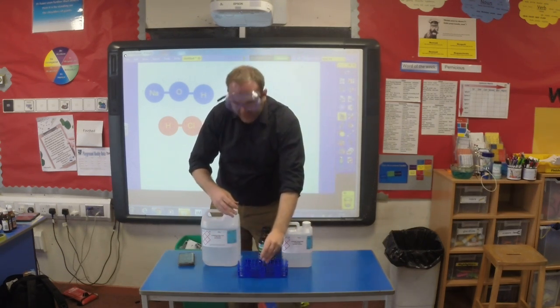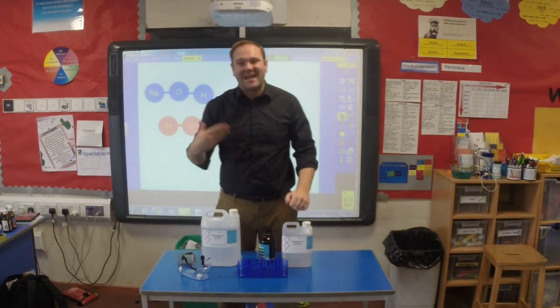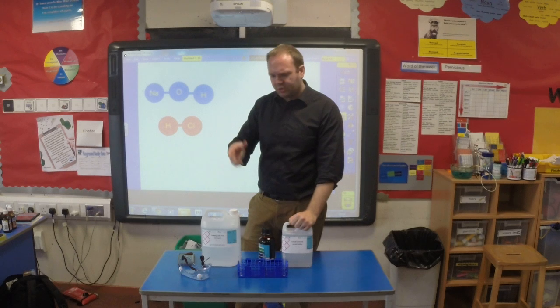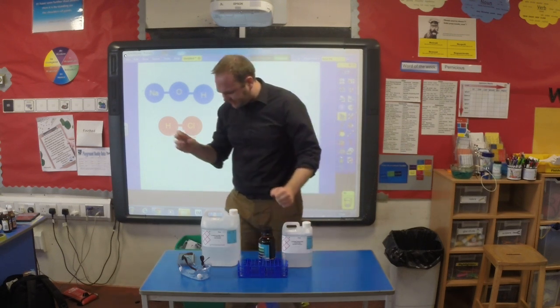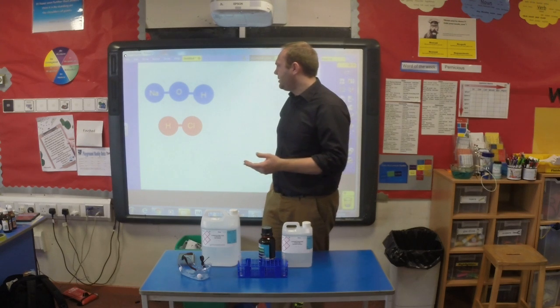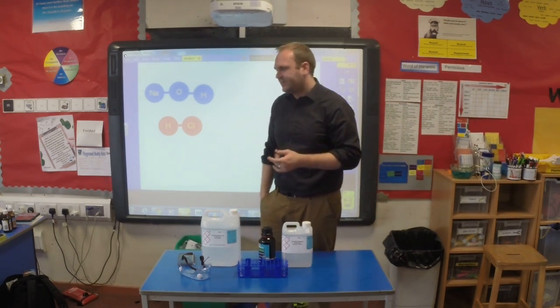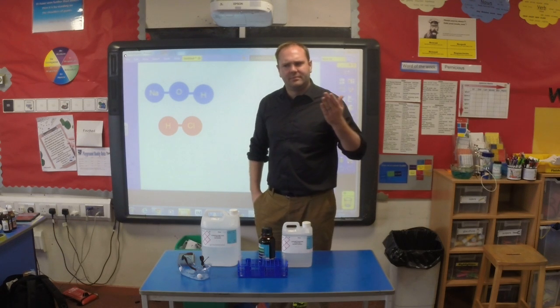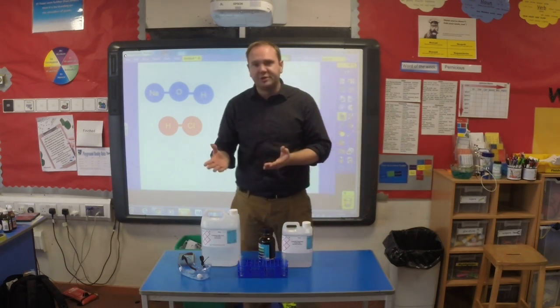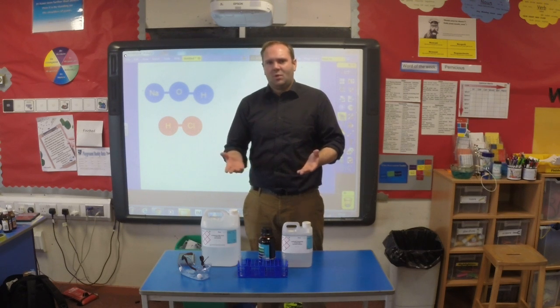But the kids can experiment with it, and either way, at any point they should be able to get it back to green without too much work, as long as they're very cautious and very methodical with how they measure it out. So the next step that you could do is explain to them what's actually going on here, and this is definitely getting up to high school level stuff now. But particularly your kids that have some enthusiasm for science, they'll want to know this stuff, and if you're capable of teaching it to them, why not do it?